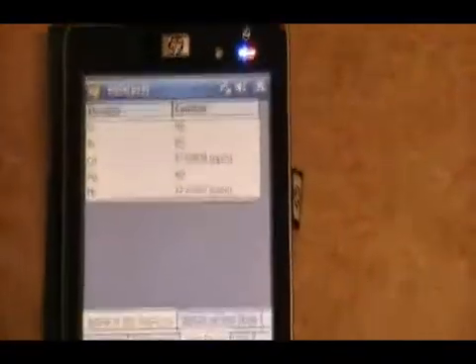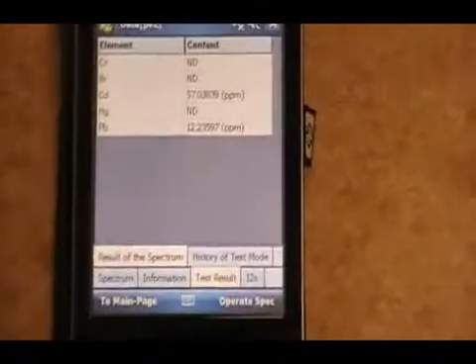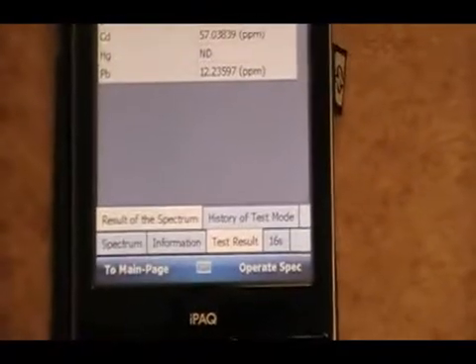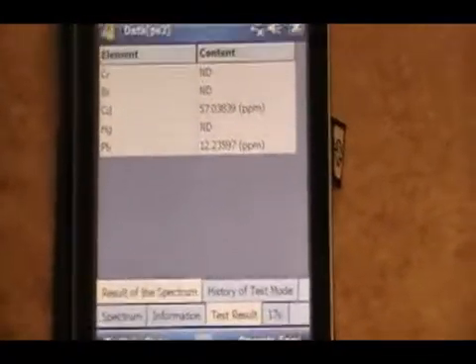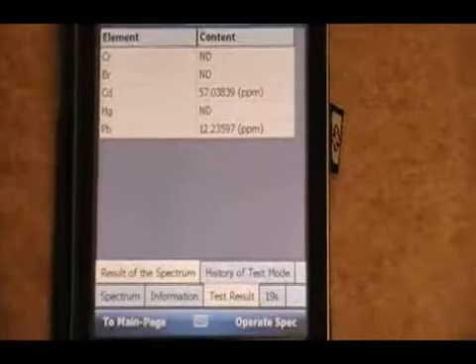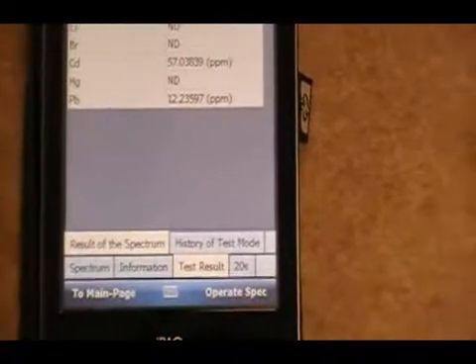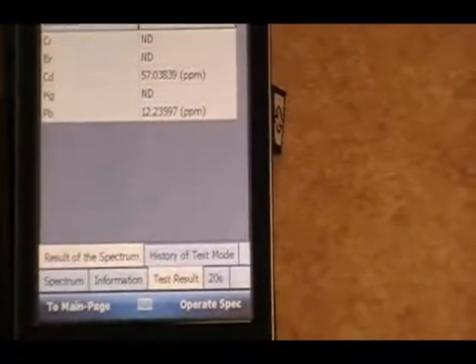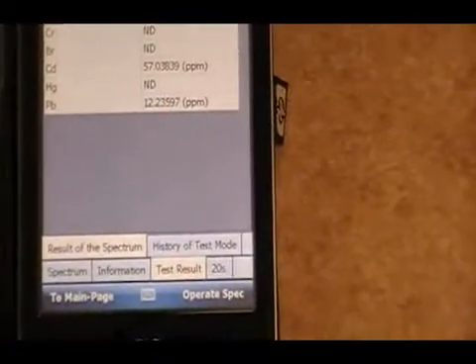It's 10 seconds in, now to 11. At 10 seconds, it starts showing numbers. Don't be alarmed if it shows a number that you think is a little high on a blank to start. As the program runs, that number will come down.